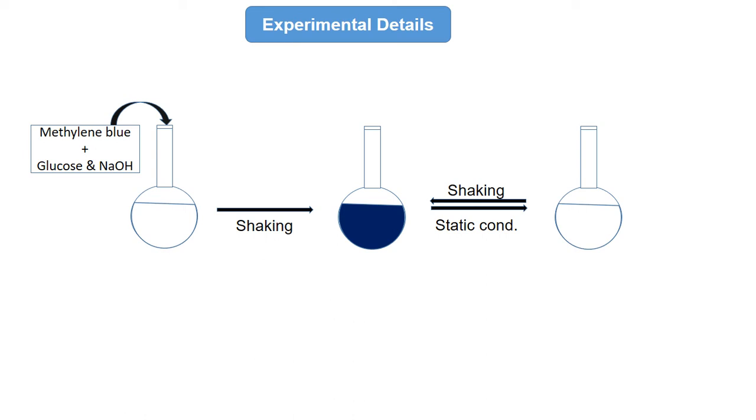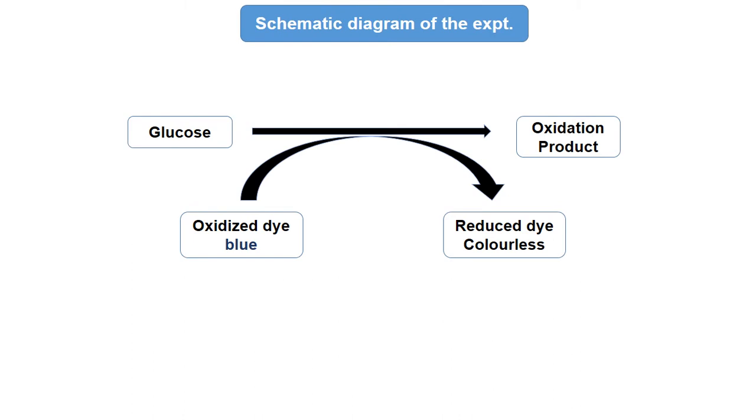This is an interesting experiment to present in front of school students, like school students or kids. It's good to play and also not hazardous or anything, not dangerous. Simple experiment but interesting. And here is the schematic diagram of the experiment.